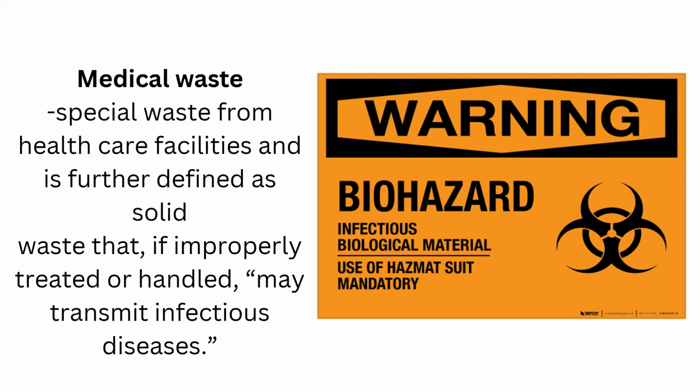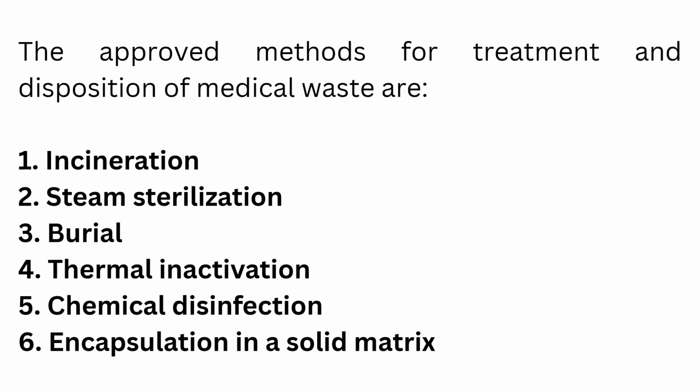The approved methods for treatment and disposition of medical wastes are the following: incineration, steam sterilization, burial, thermal inactivation, chemical disinfection, or encapsulation in a solid matrix.